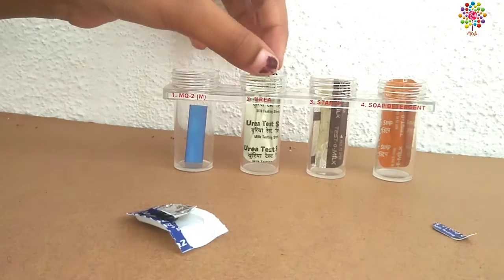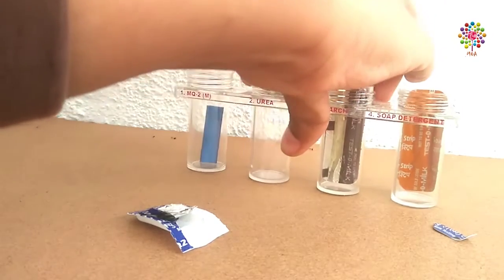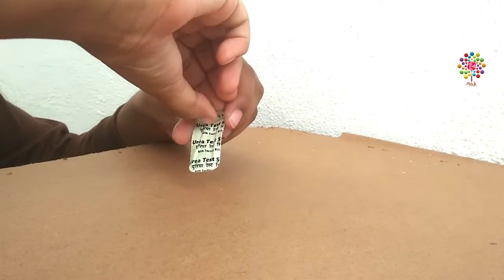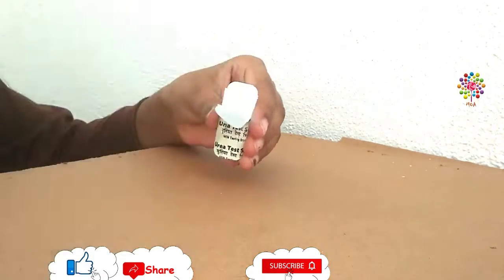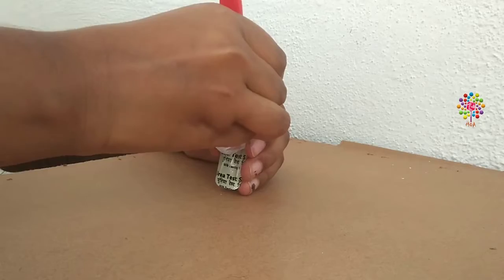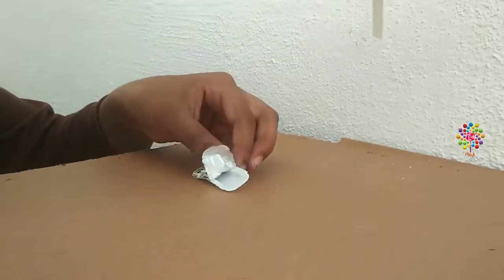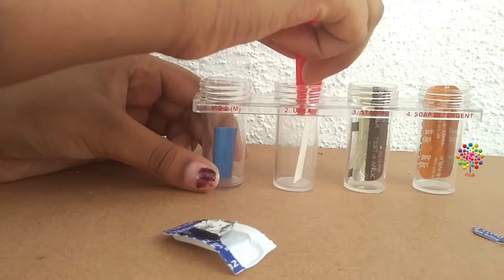Now let's take the second one and open this also. Let's open the test for urea strip. I have opened it a little bit. Now, with the help of forceps, I will take it out and keep it here. Oh, it fell.